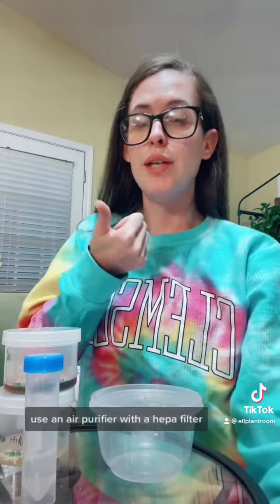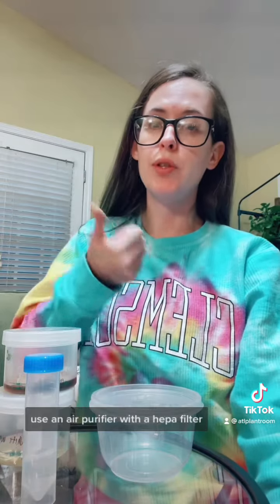The air — how the hell do you clean the air? Use an air purifier with a HEPA filter. Turn off your AC, close your vents, don't open windows and doors — no airflow. Flow hoods are amazing; they have a filter that filters out everything.